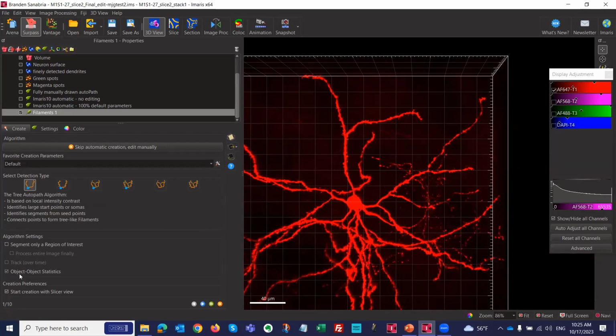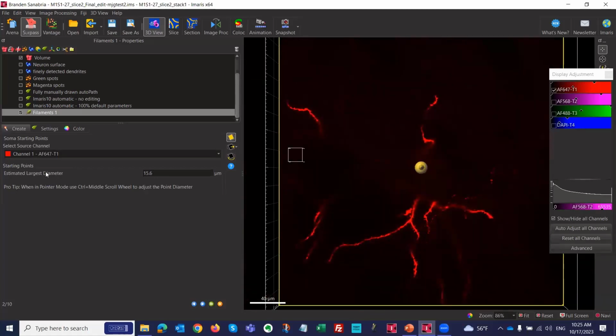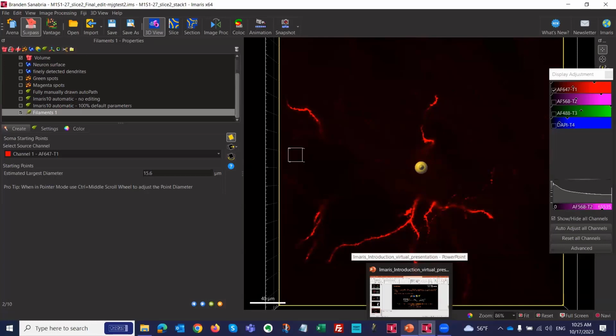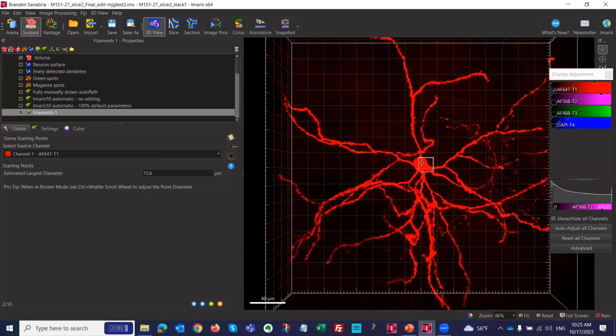So I have to make sure that object-to-object statistics is turned on if I want to use the surface that I created before to help me with. So I turn it on. Sounds good. Next step. I choose the channel by default. I mean, the first channel here is good. And I need to choose a starting point. Okay. So this guy here, if I go back to 3D mode, this is my starting point, my cell body.